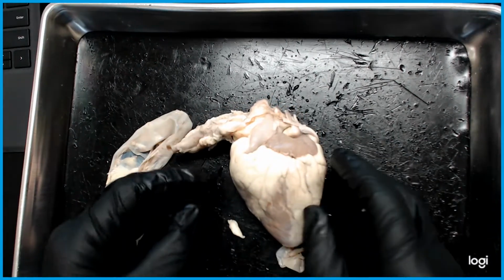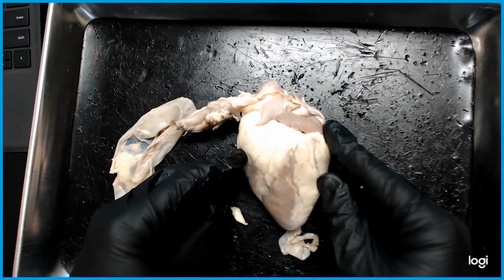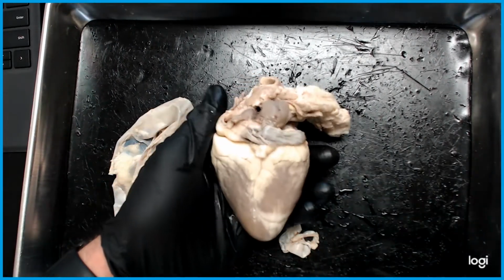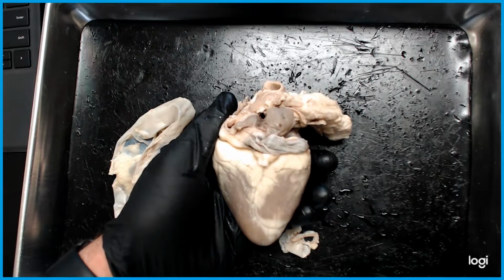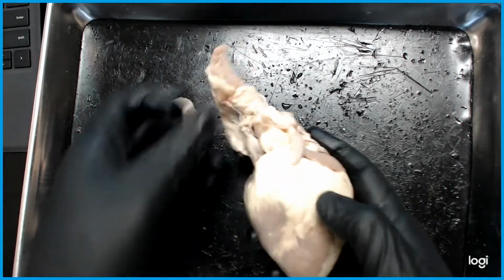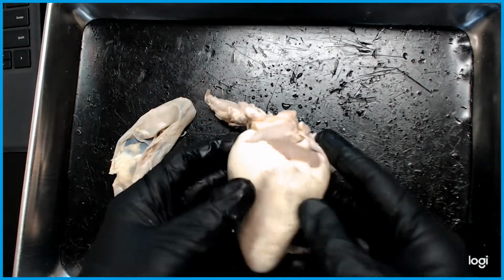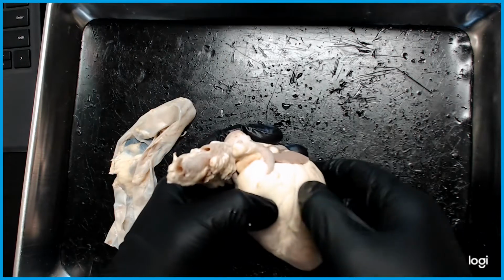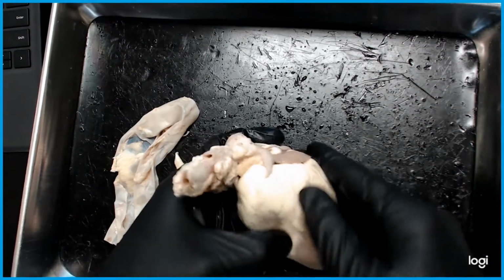So now we look at the heart, and we want to have a ventral view, an anterior view, first of all. So what do we have? We inspect the heart. What are we finding? We look for the left and the right coronary arteries, and coronary arteries in general. And if you follow this one right here, this usually gives you the division.